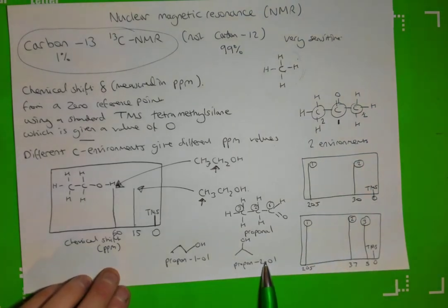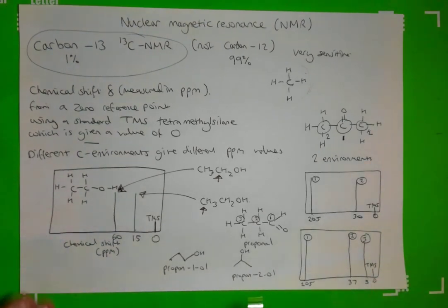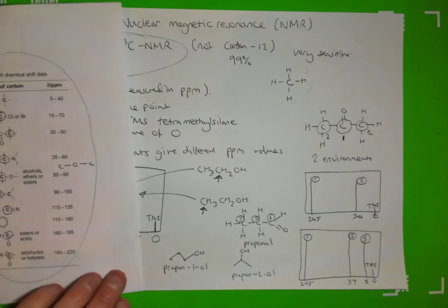And that's propan 2-ol. So how many peaks would propan 1-ol have, and how many peaks would propan 2-ol have, and can we suggest some values of those peaks?